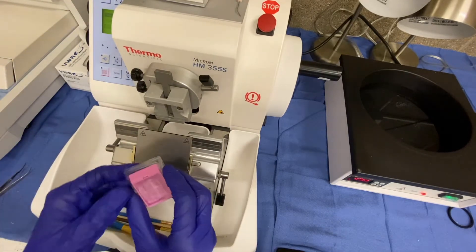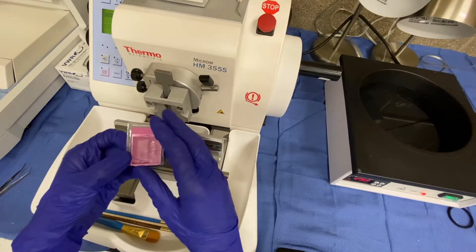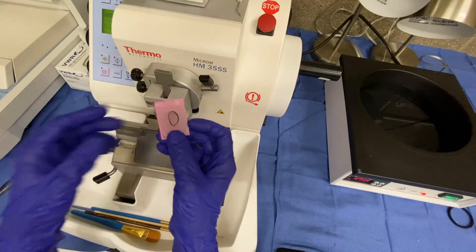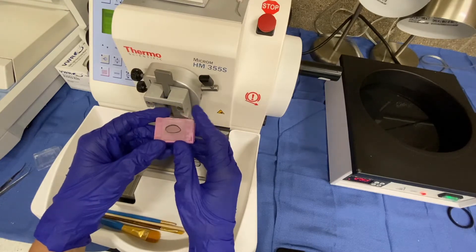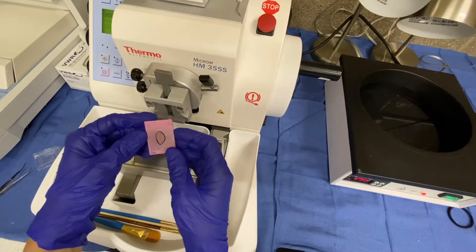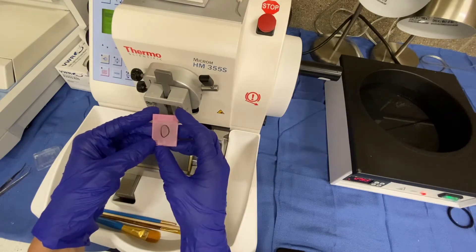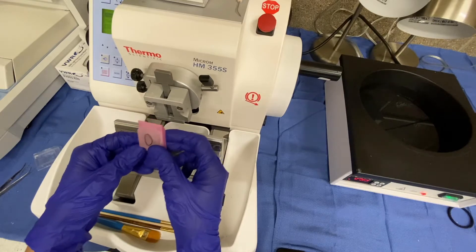We have allowed our block to cool, and you can see it is now in our plastic mold. You go ahead and remove the cassette block from that, and you can see our tissue here. In this example, you can see black ink. We are cutting into the true margin of the specimen, which is a tube. This is an on-end specimen and also on-face because we're cutting into the true margin.